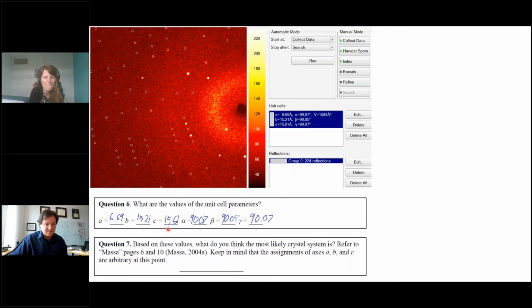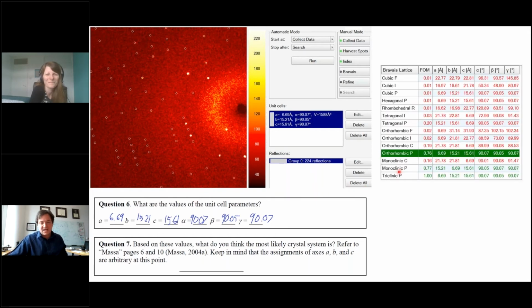And then this becomes a fun sample because they look at these 15.21 and 15.61. Well, are those really different, or are they the same? And we see how many of them are going to guess tetragonal and say, oh, these are probably the same, and how many of them are going to guess orthorhombic, and we have some fun and see who's going to be right and wrong. Of course, all the students get full credit whether they've guessed tetragonal or orthorhombic.